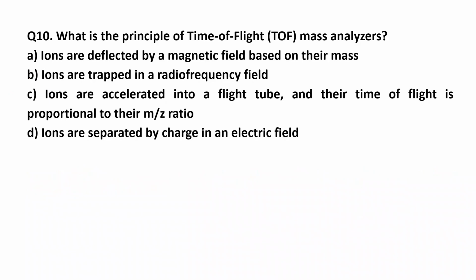What is the principle of time of flight mass analyzers?